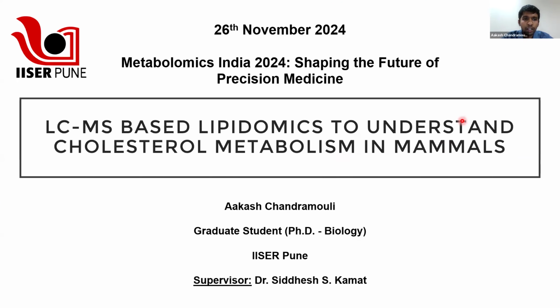Good evening, everyone. Today I'll be talking about LCMS-based lipidomics to understand cholesterol metabolism in mammals. To begin with, I'll give a brief intro of what lipids are.